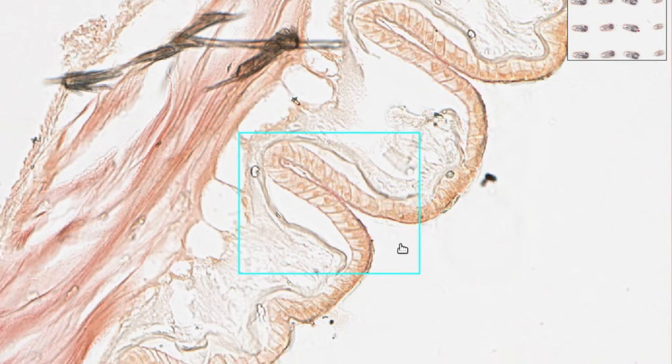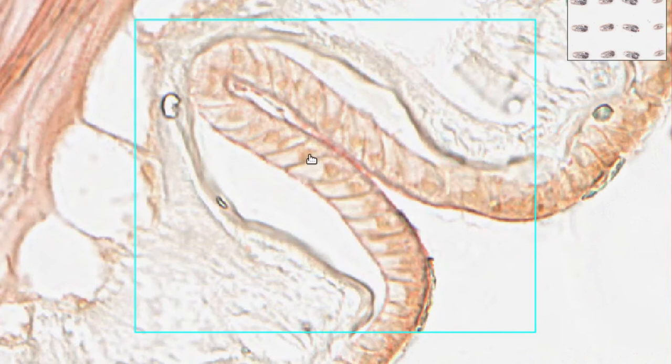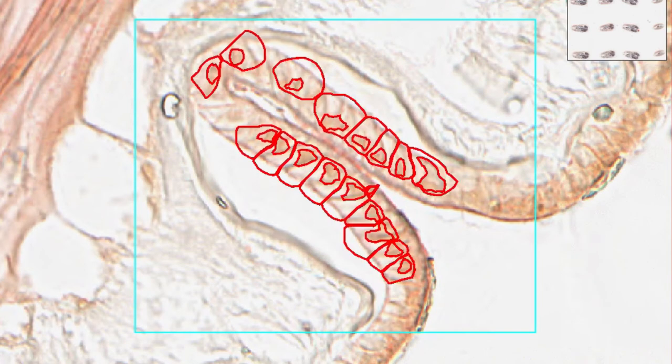So lancelets have an epidermis formed of a layer of single cells and we can see them here. They have quite distinct cell borders. So if we zoom in, we can see just make out the nucleus here and then the cell membranes between each of them. I can turn on cell detection in this program and it'll highlight the nucleus here in the darker red and then each of the individual cells that it's decided it's going to pick out.